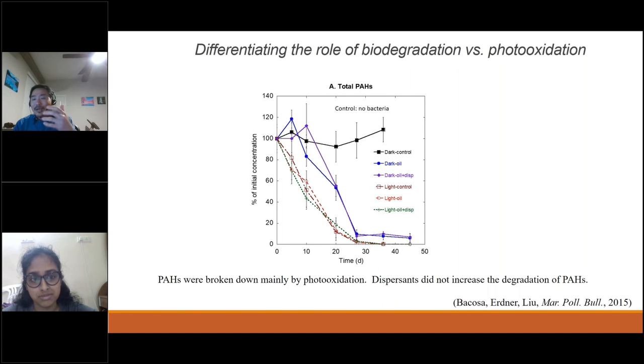So you separate the two phases and do it 3 times. You combine the 3 extracts and roll them down to 1 or 2 mL. Then you're ready for your GCMS or GC-FID analysis. I think that's also a very easy approach. Honestly, I think the recovery will be better than the SPE. You just need a little bit of labor: you have to shake the separatory funnel for a couple of minutes, 5 or 10 minutes or something like that.